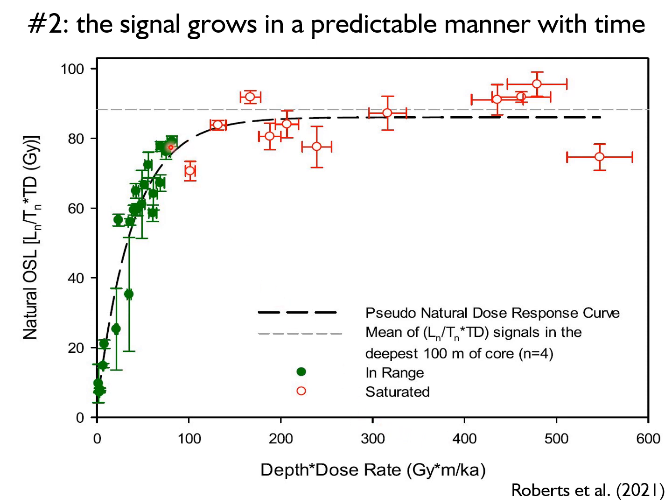If we think about applying luminescence dating in that case, the part delimited by the green data points is where it is the easiest to apply luminescence dating. For the red part, it's very hard to get precise ages.